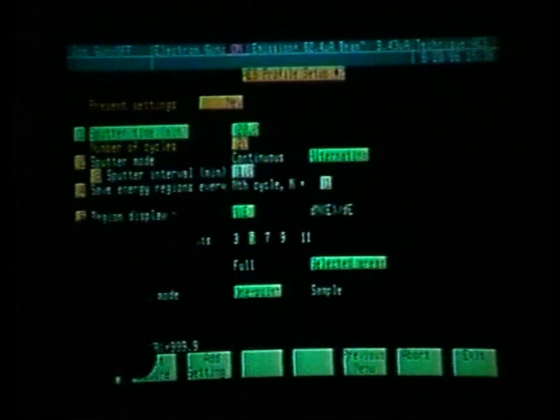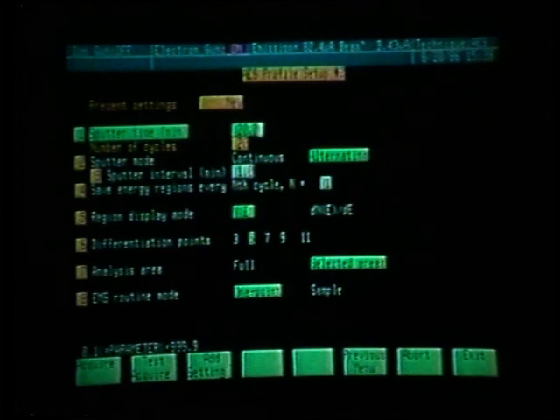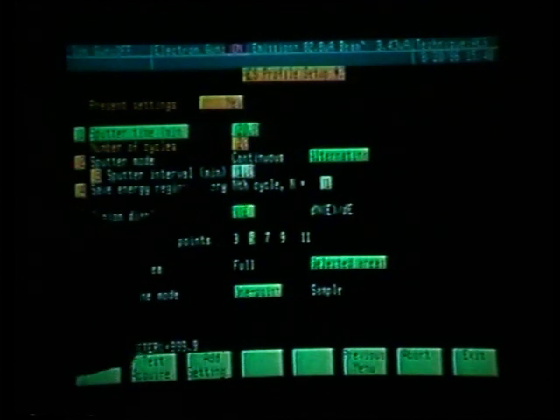If our sputter interval is every minute, then in 20 minutes we will have 20 data points, meaning we will sputter for 1 minute, then collect data on the carbon, oxygen, chromium, copper, and silicon peaks, sputter another minute, and then collect data again. That would be 1 complete cycle. Depending upon the thickness of the layer and the sputter rate which we have set up, we need to determine the sputter interval.